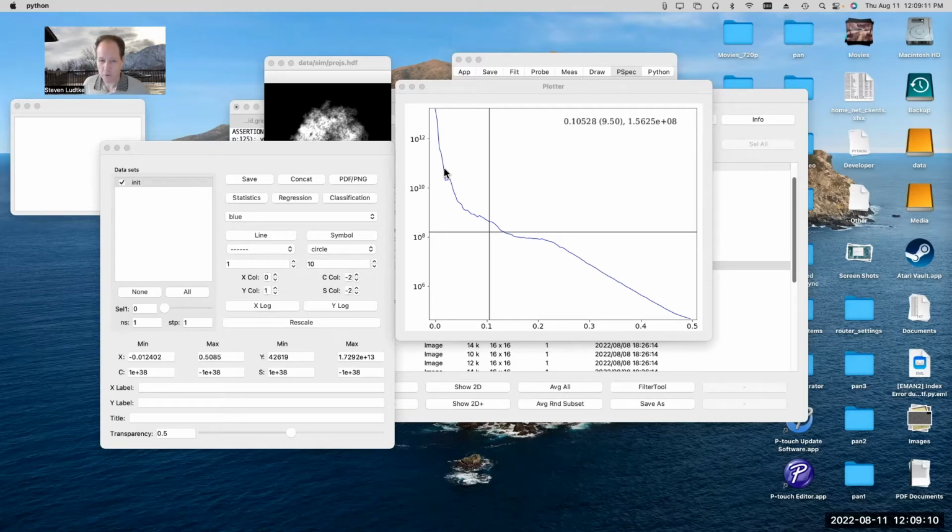Now, we could try for very, very realistic data generation. There have been several groups that have developed very realistic microscope simulators over the years, which include various terms for noise and all the proper envelope functions. Lan was just telling me that at M&M, there was someone using GANs, a type of neural network, to generate simulated data in materials science.